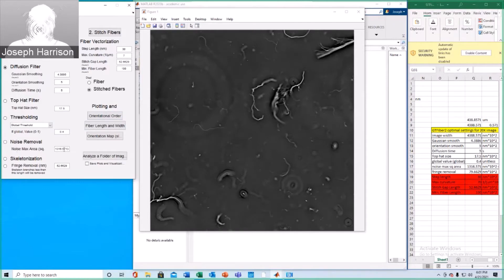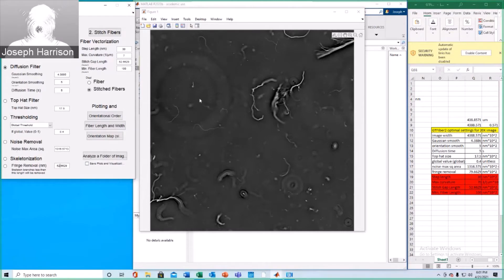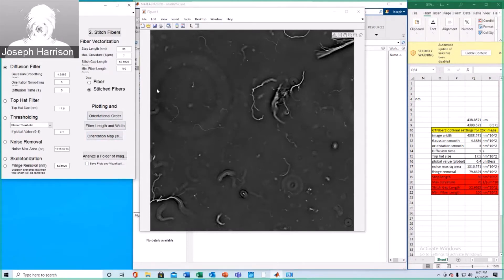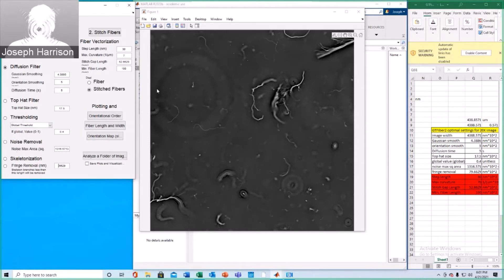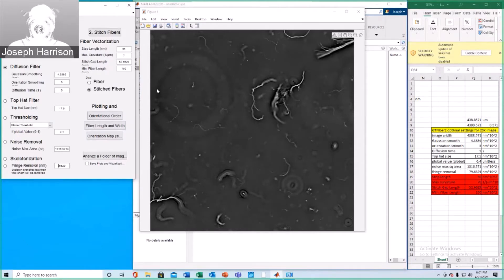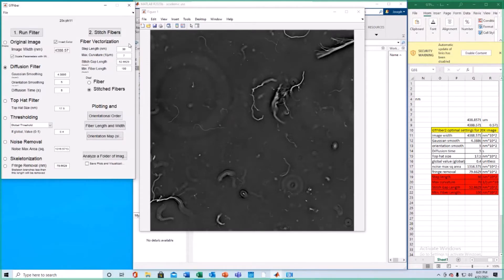This noise max area can be left as is. And fringe removal, we have a lot of little tiny particle kind of things here, so we're going to want to increase it just a little bit to remove any sort of noise that may result from a lack of sensitivity.